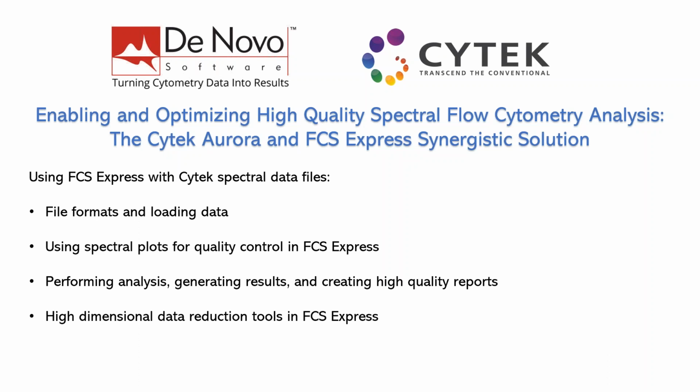Once you have acquired your data using Cytek systems, well, now we have the ability to use FCS Express and work with the Cytek Spectra data files. And that's not simply the unmixed FCS, kind of standard FCS files. That actually means we can work with the spectral data as well as the raw FCS files together directly in FCS Express. So what we're going to focus on for about the next 20 to 25 minutes is using FCS Express with Cytek spectral data files.